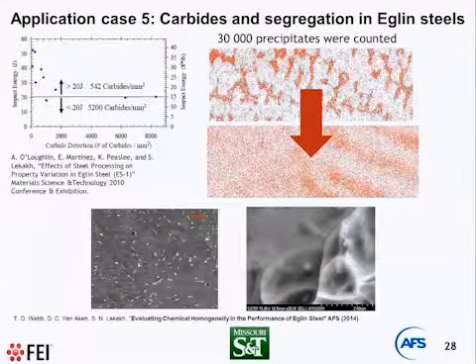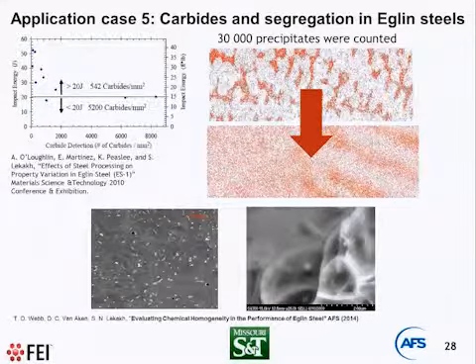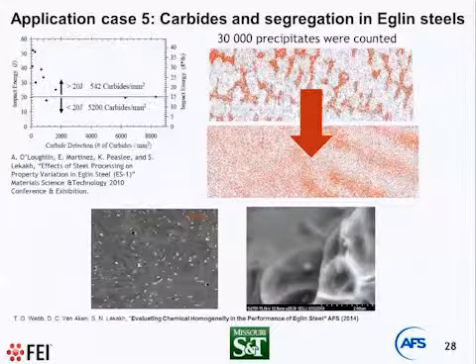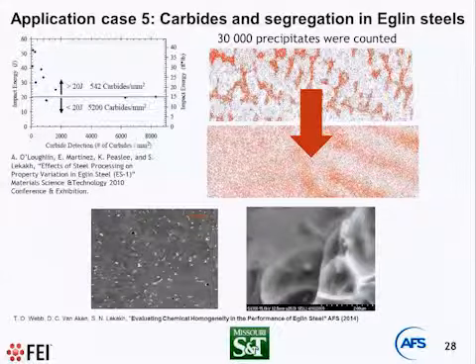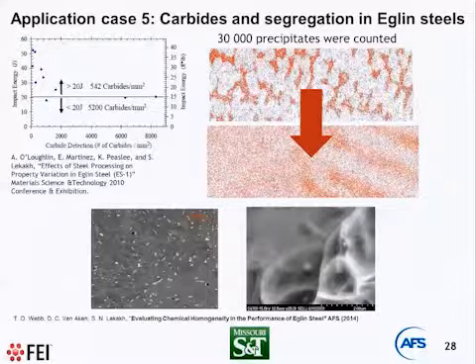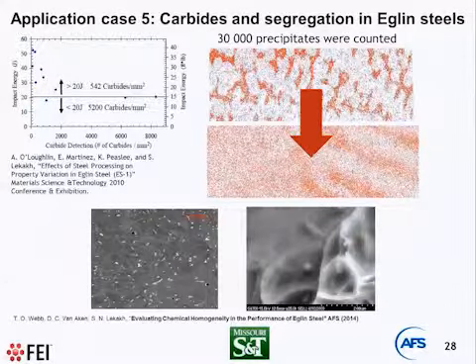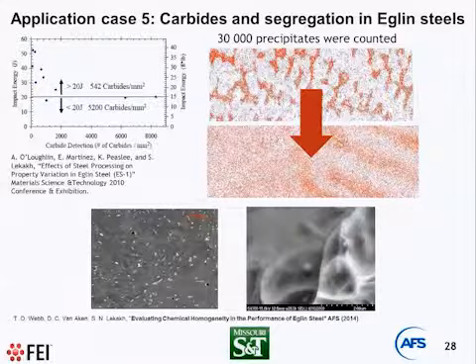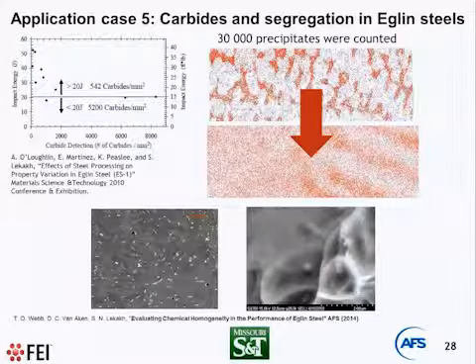And we definitely see that this inclusion were located in interdendritic region. It means they located in segregated area. This was key finding. Then we found technique allowed to produce homogenization, and that final result, we have fine precipitation, remove all of this segregation.